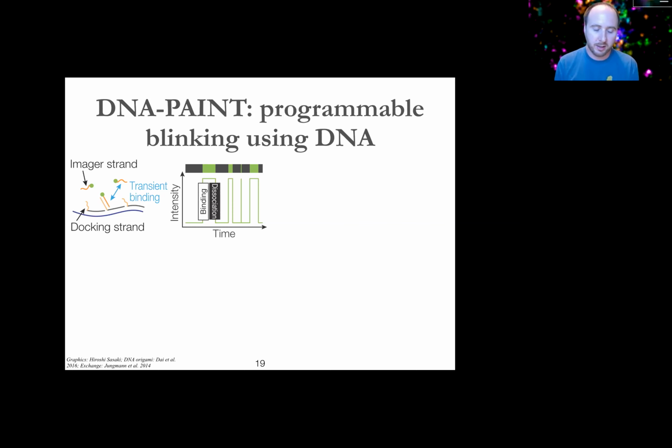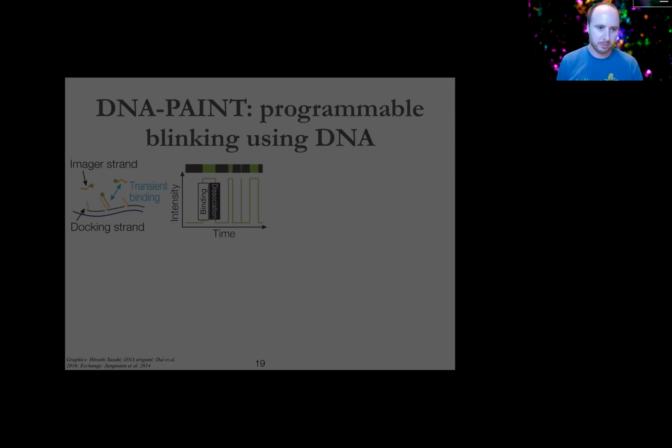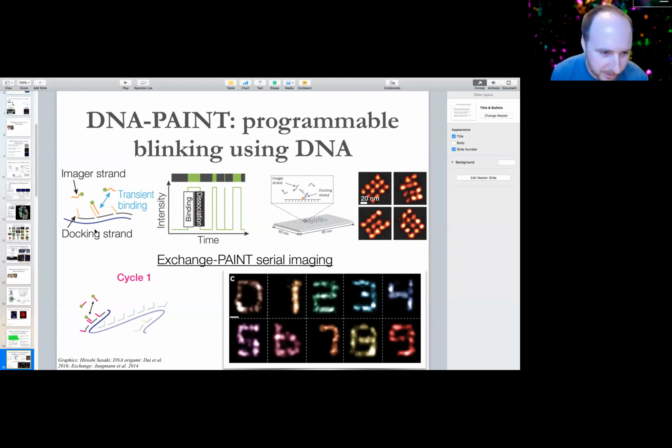is it's another DNA hybridization powered technology that comes from placing specific sequences of DNA in certain places and programming binding events to them. So in this case, in the illustration I have here that I hope you can follow, this is where, actually, we're just going to do it live. I'm going to use my mouse here. I just think it's going to be a little bit easier, and I'll go back to the full screen.